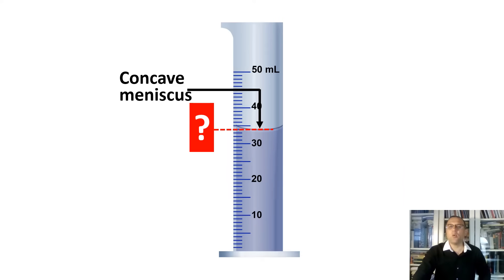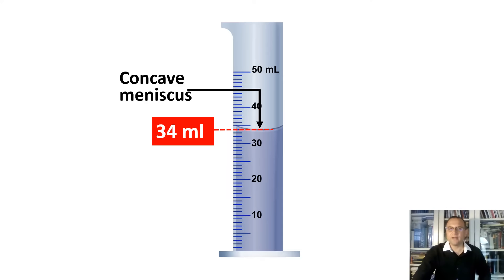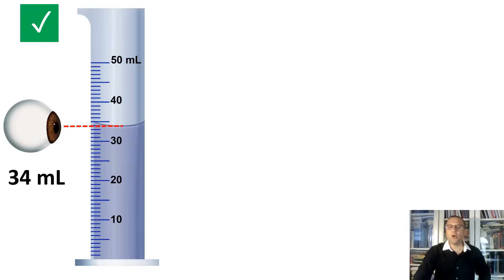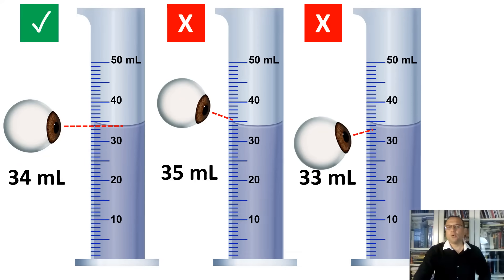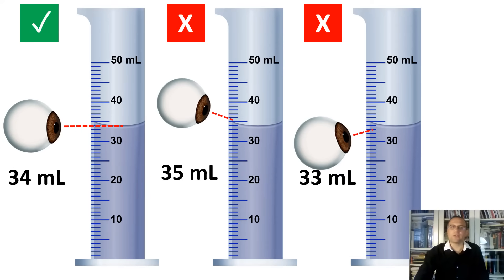So what is the volume of water in this graduated cylinder? 34 milliliters, correct. It is important to read the graduated cylinder from eye level — at eye level you will read the accurate volume, in this case 34 milliliters. If you are too high, you will read a bigger volume, in this case 35 milliliters. If you are too low, you will read a smaller volume, in this case 33 milliliters. This is very important to remember when making measurements of water or different types of solutions.